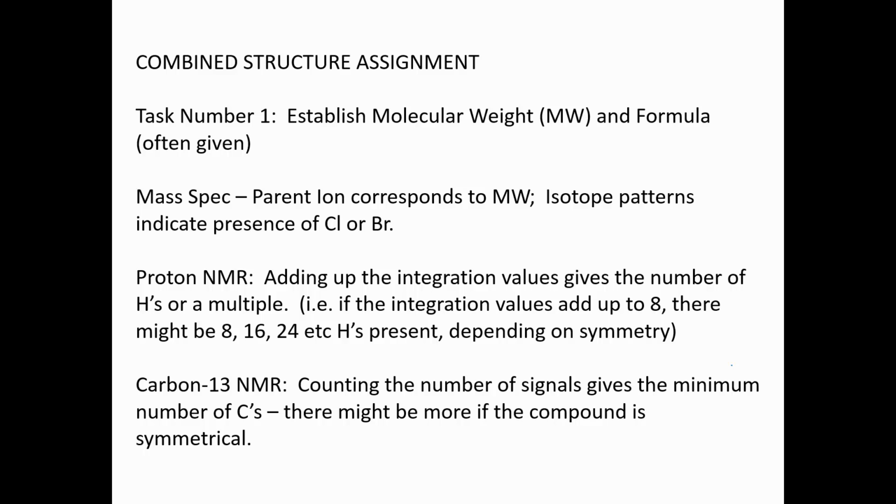Okay. In this video, we're going to look at how to assign the structure from having multiple forms of spectral data available. What I'm going to talk about here is considered generally the most logical way to approach it, but if something works different for you, go with it, okay? The only objective here is to come up with a unique structure that fits all of the spectral data given.